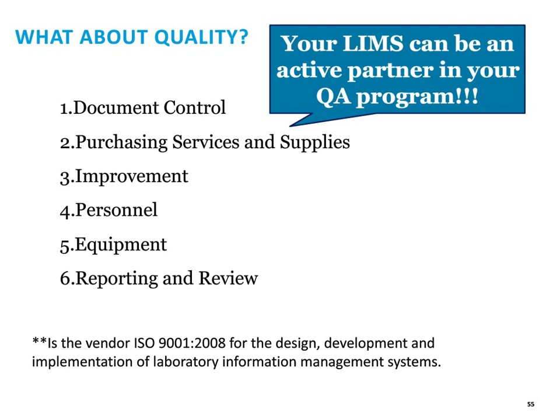So if there is an issue on a case, you can just link the corrective action directly to it. You could actually conduct your quality audits there within your LIMS. Everything's linked. Documenting your personnel's training records, what they're certified to utilize, and what equipment and analyses they can conduct. For example, if we do have an analyst that we've hired and maybe they haven't been certified to perform every analysis in the system, your LIMS should be able to limit them just to those things they've been certified to perform. Same thing with equipment.